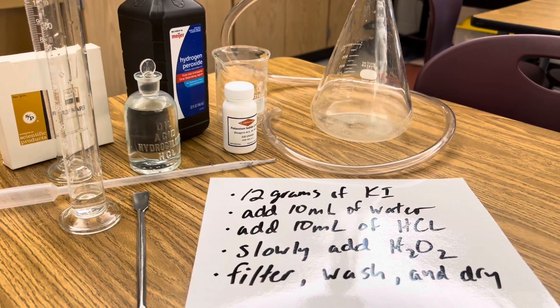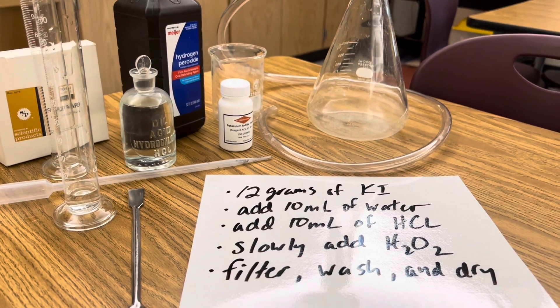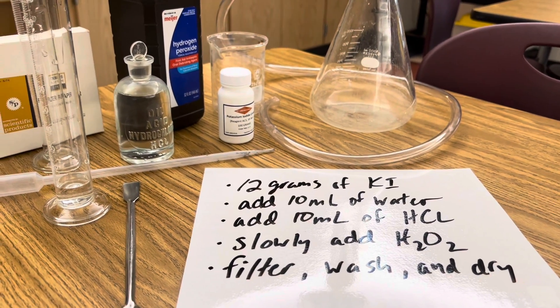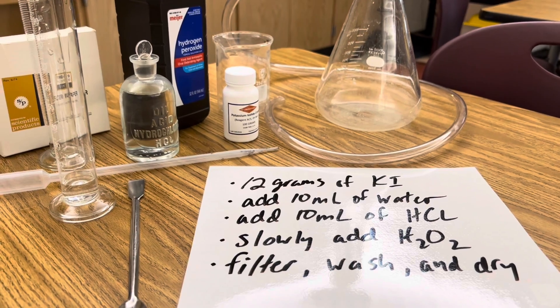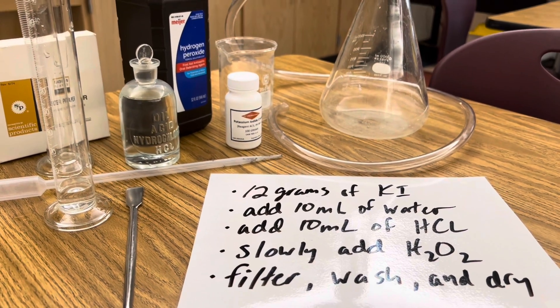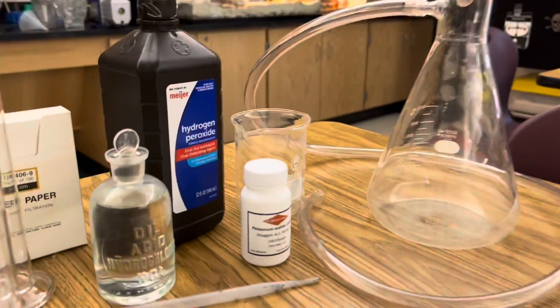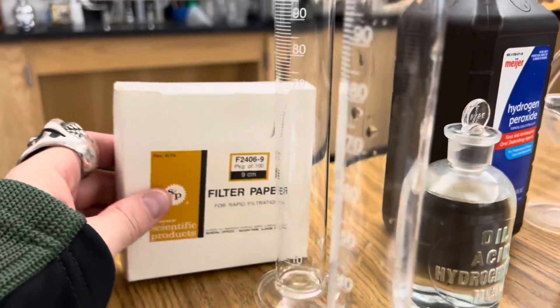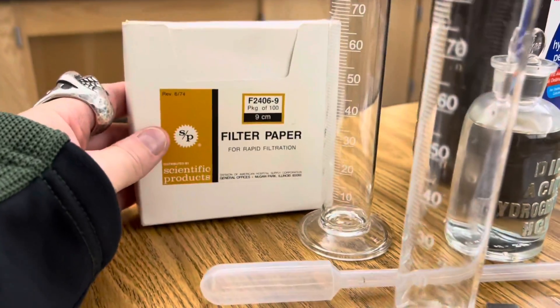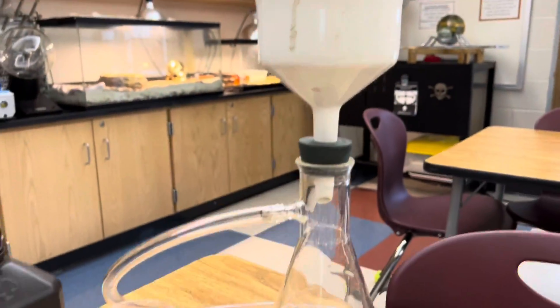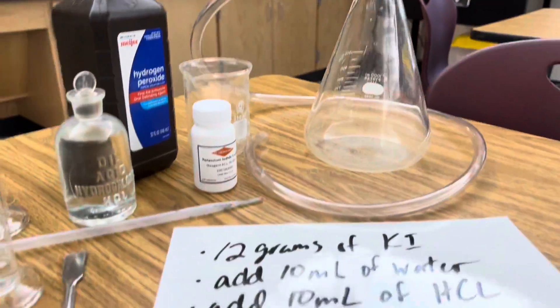All you need for this reaction is 12 grams of potassium iodide, about 10 milliliters of distilled water, 10 milliliters of hydrochloric acid, and some 3% hydrogen peroxide, some filter paper to filter off your iodine at the end, a spatula, and of course a flask with a filter attached to a vacuum pump.